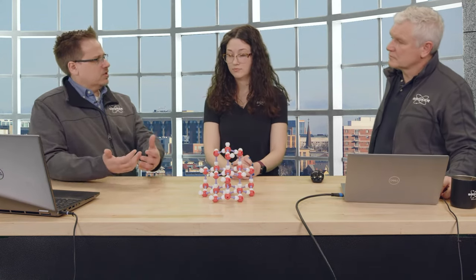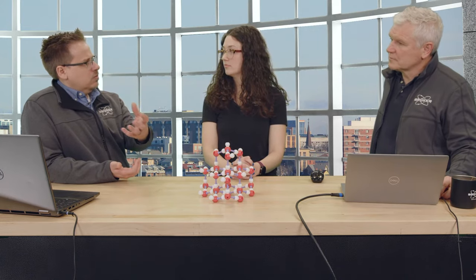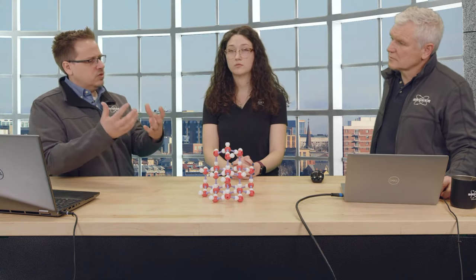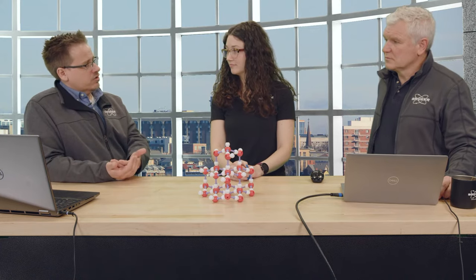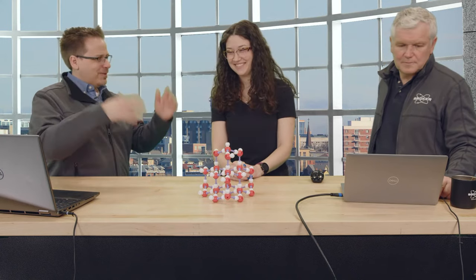If you're going to publish a structure with the modulation in it, is a lab system's quality sufficient, or does the lab give you the indication that you should go to the beamline and collect the data set to finally publish? With the stronger sources, a lot of services that previously collected smaller, weaker samples and then went to the synchrotron, this has gone away a little. A lot of people do all of their work in the home lab, and that's certainly possible today with very strong sources. So as long as you have one of those newer strong sources, you should feel comfortable submitting that paper, and your reviewer's not going to come back and say you've got to go to a beamline.